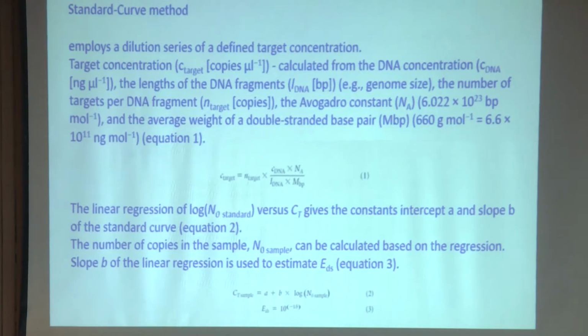For each molecule, you will be able to quantify them. So, make use of that information to quantify the amount of DNA in your PCR amplicon in a PCR reaction, and then multiply with the Avogadro number constant, and you will be able to find out the number of copies of that amplicon present in your reaction vessel.